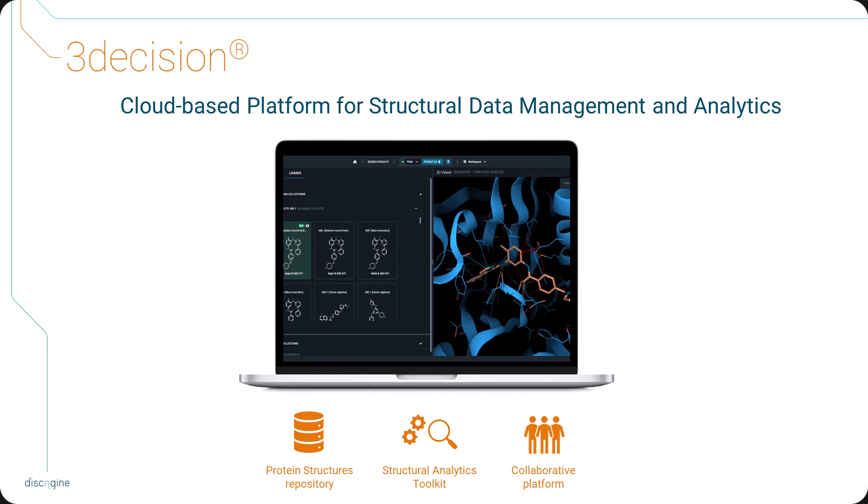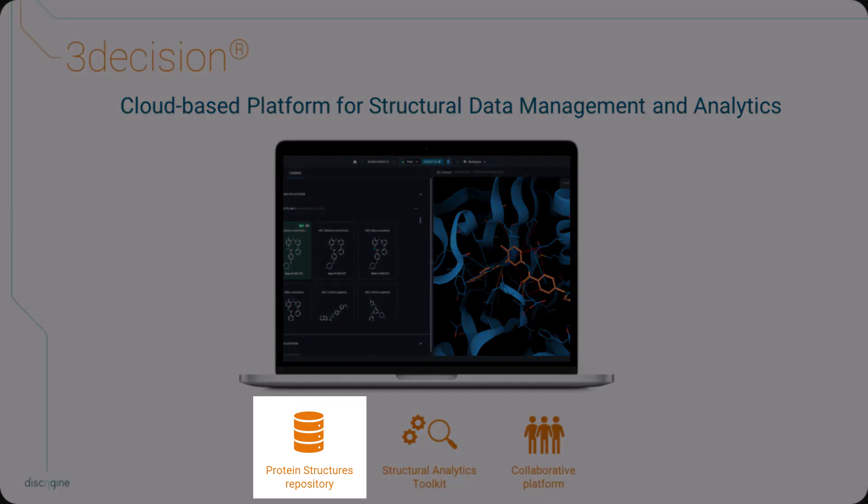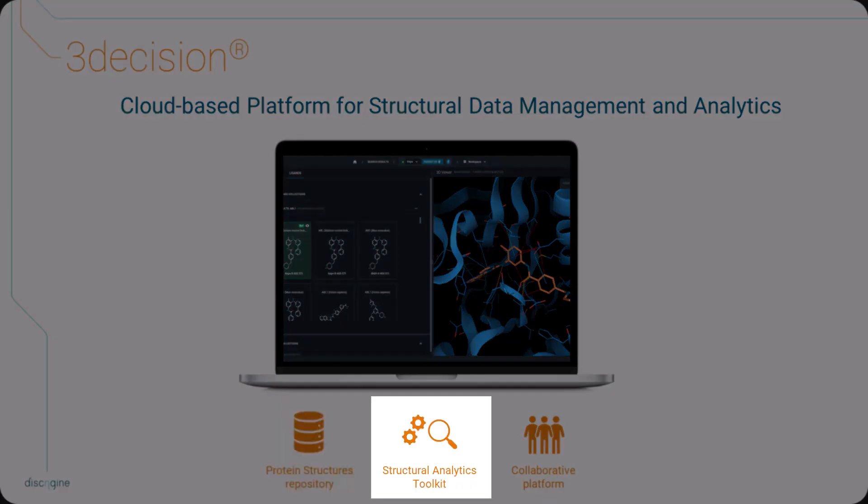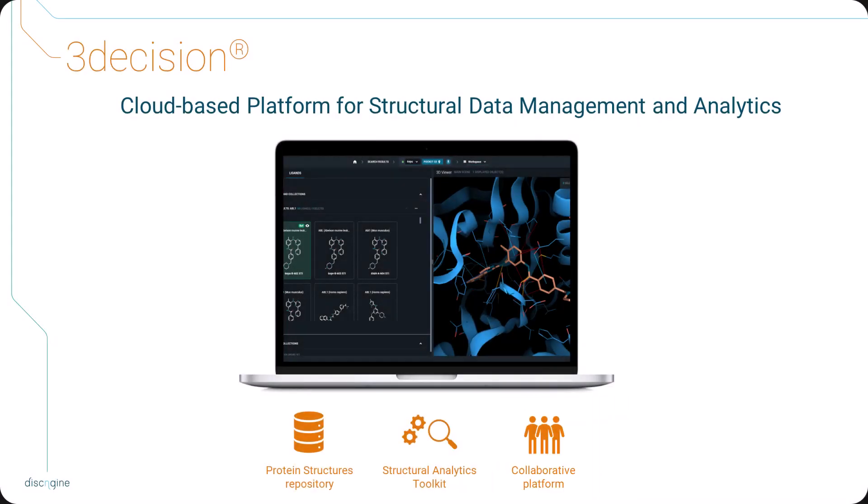It allows the whole drug discovery team to store, analyze, and share 3D structural data, all in the same platform, to extract key insights for structure-guided drug design.